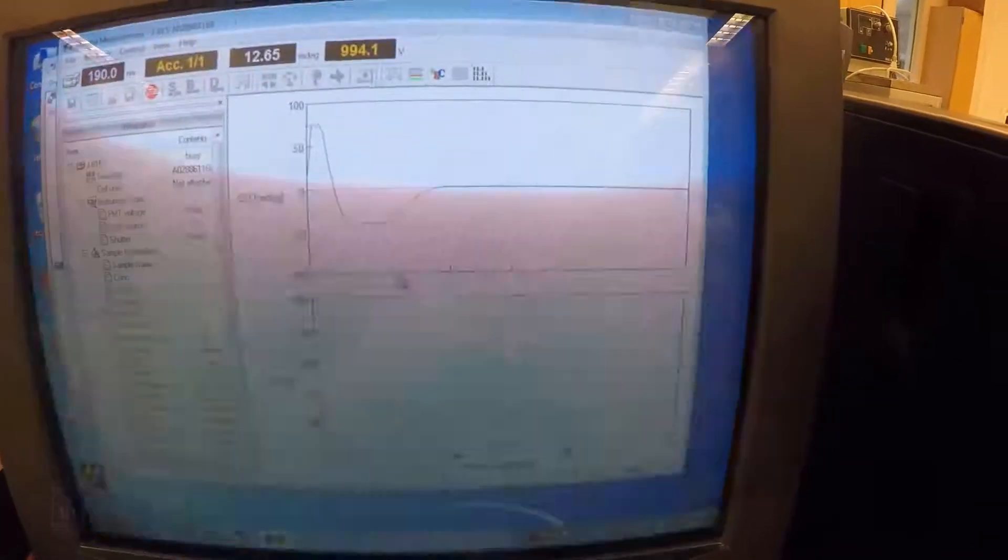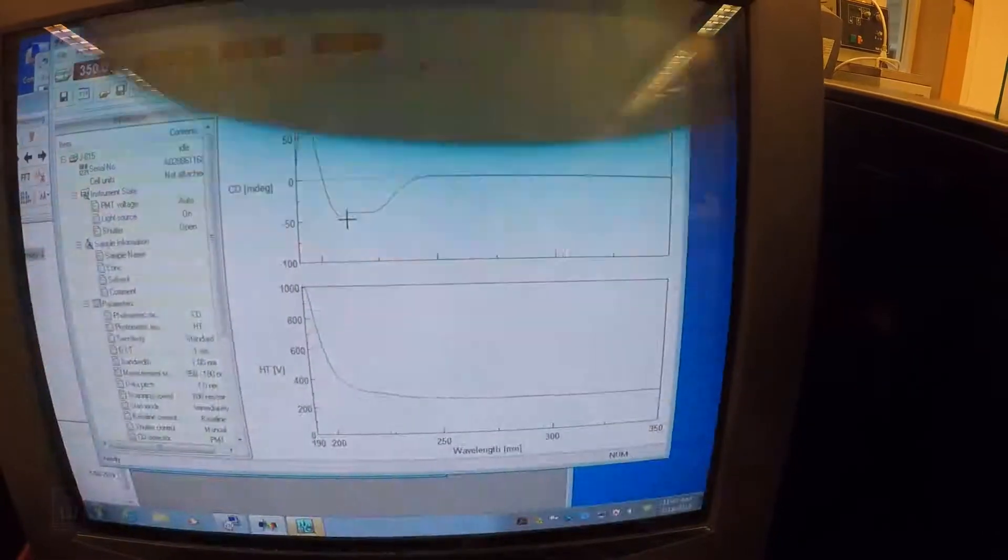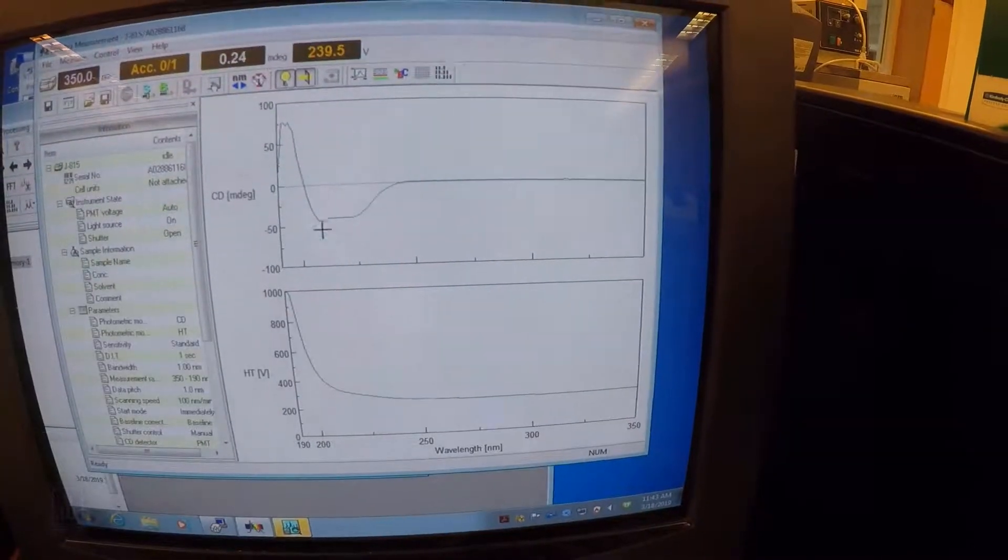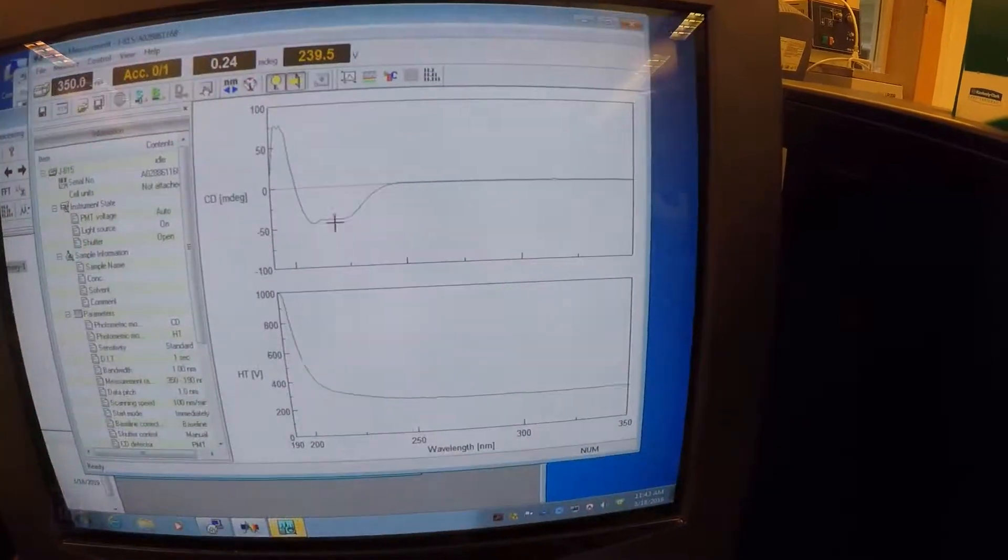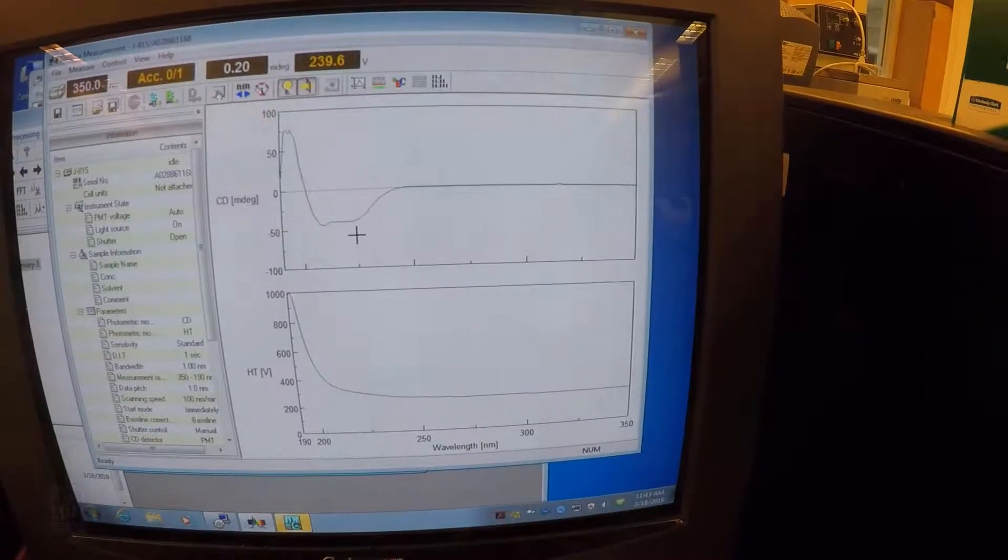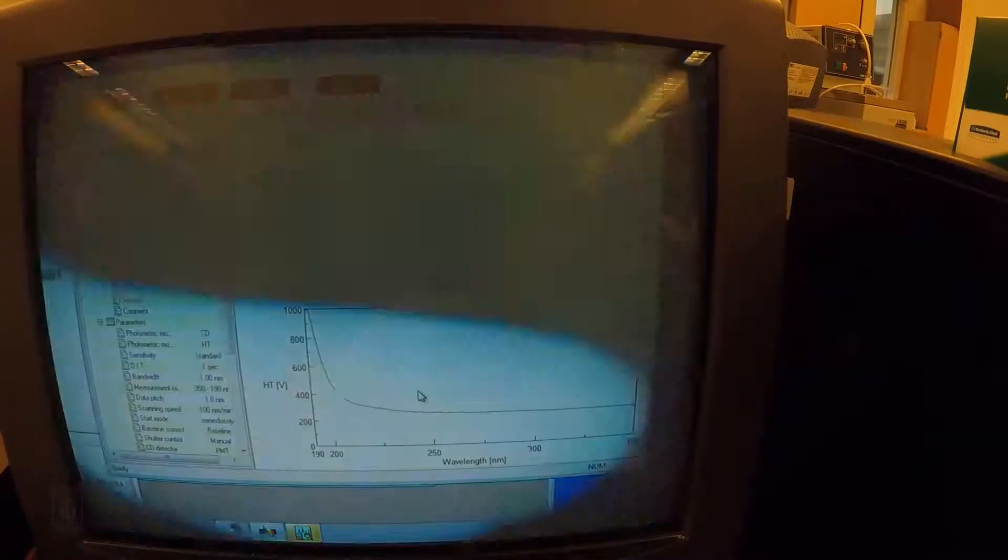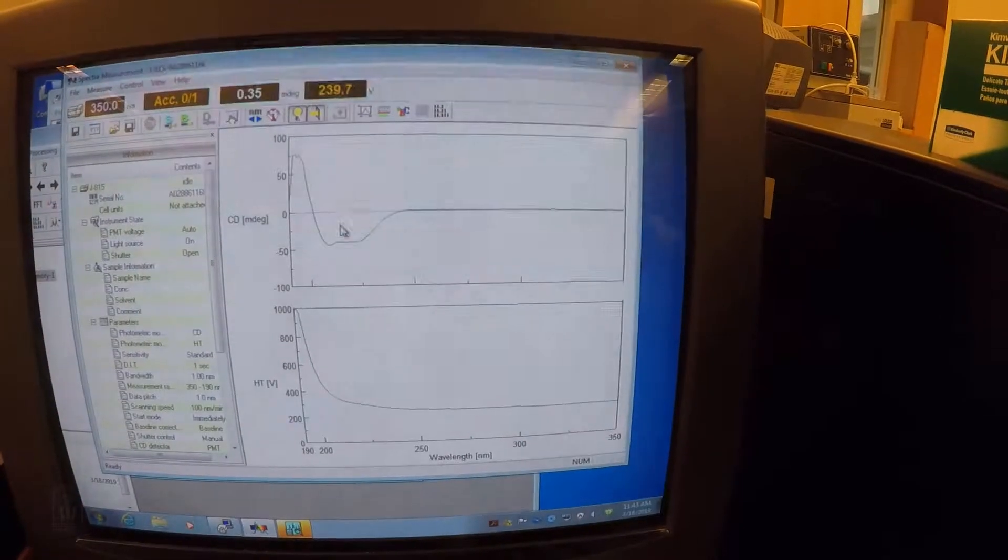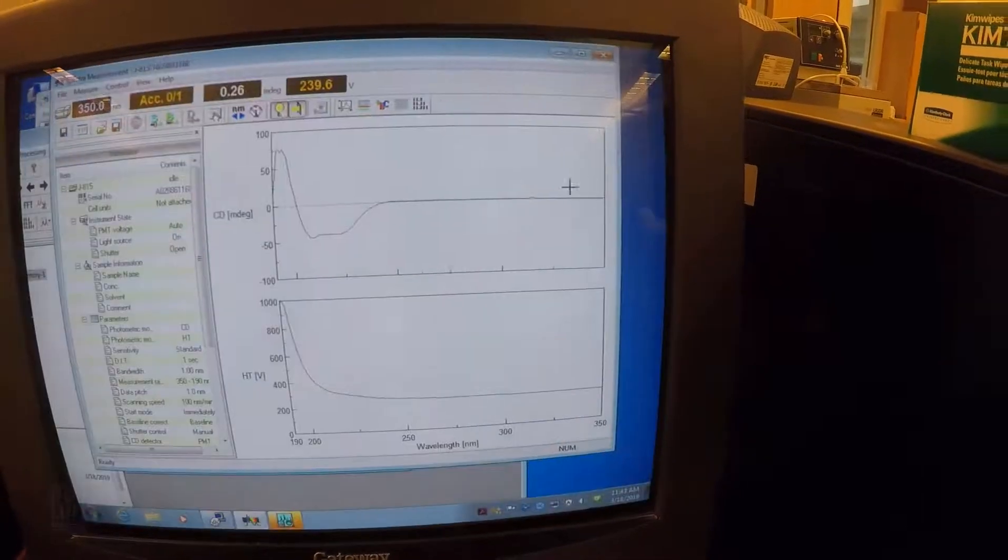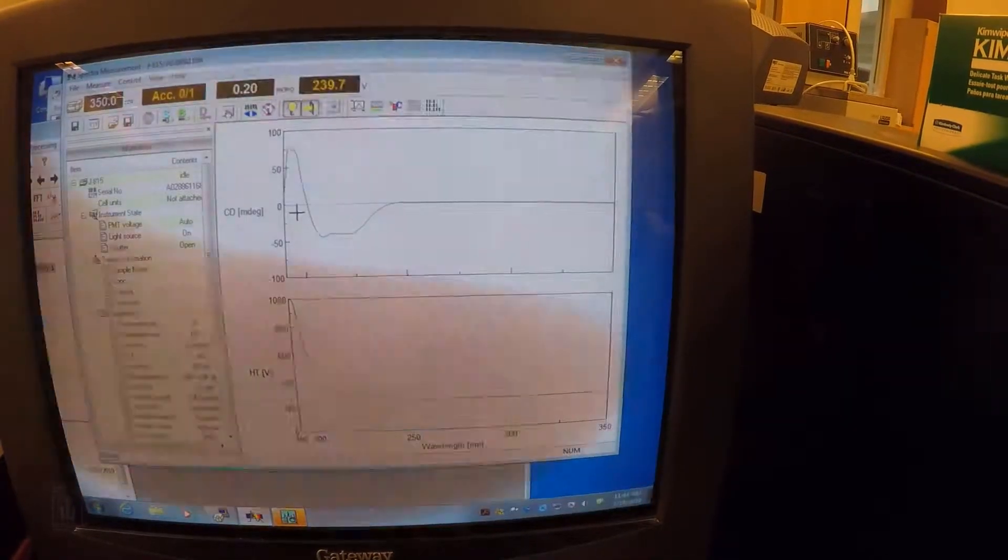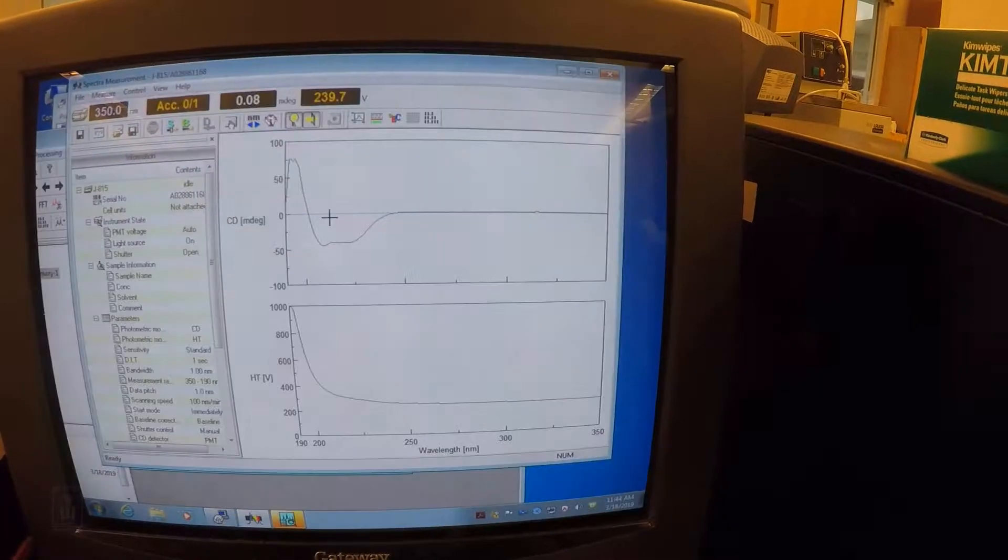Here's the classic appearance of an alpha helix protein. We have a big trough with two minima, one minimum here around 205 or so, and then one around 220. The 220 is typically the one that's used to scan helices as they change. But this is what you would expect to see for an alpha helical protein. Beta sheets would have a single minimum at a different place, and then unfolded proteins would have really no dips or peaks at all. So you can use these general appearances to kind of figure out what's going on.